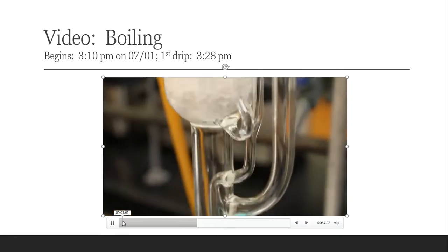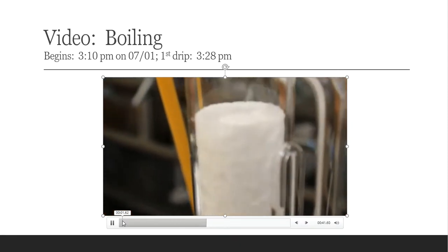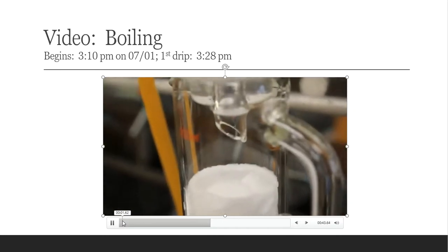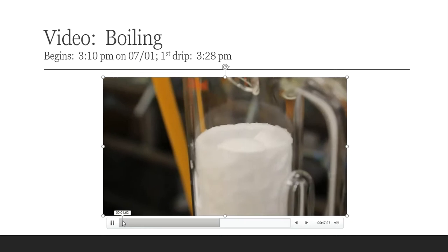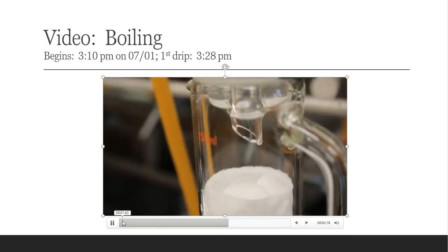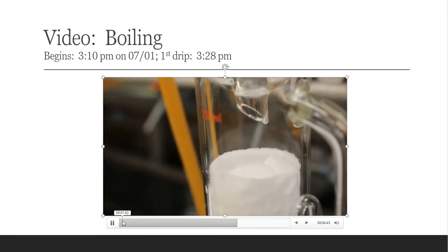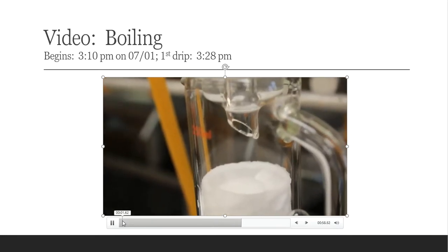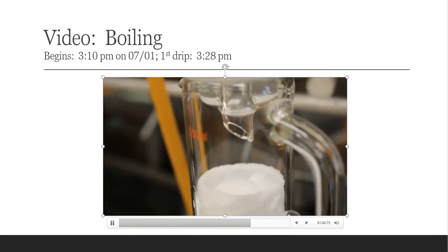Up here at the very top, I'll give you an example of what I'm talking about. Here is the Soxhlet with the thimble. And if this ether had made its way to this area, I would start seeing some drops here, and I don't. I might see a little residual one off of this thing right now, but that's due to the liquid that I poured in through the top, not from the evaporation from what's down below. That would happen much quicker.